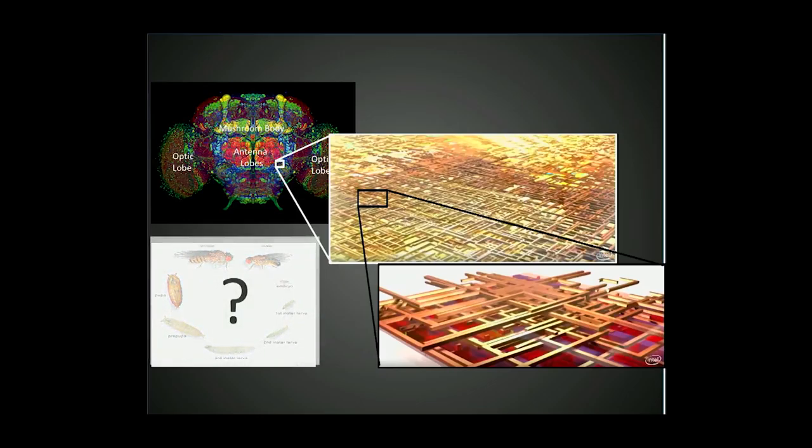Now if you want to reverse engineer it, it's a tough problem, and we need tools from across the spectrum, from biology, from genetics, and I'll talk a little bit of the aspect that can come in from the semiconductor industry, that FIB-SEM.